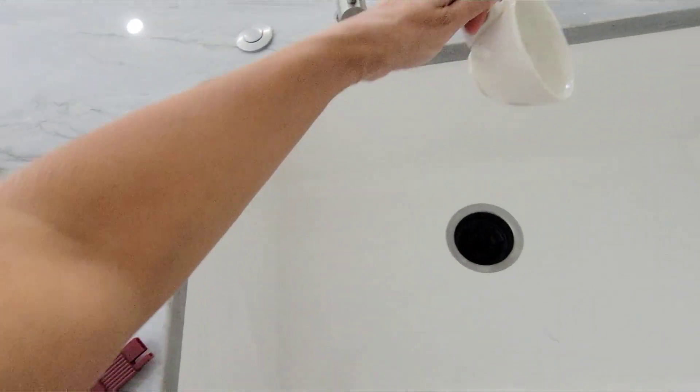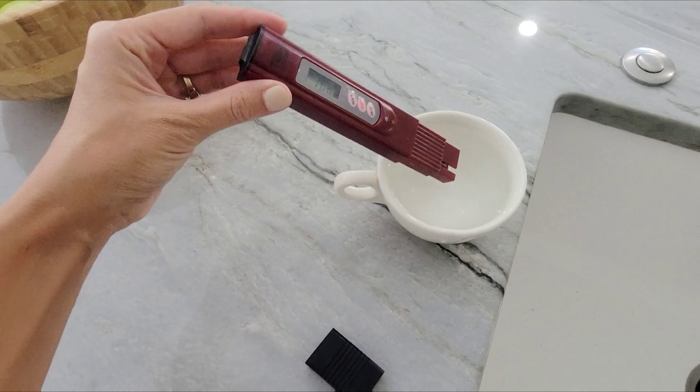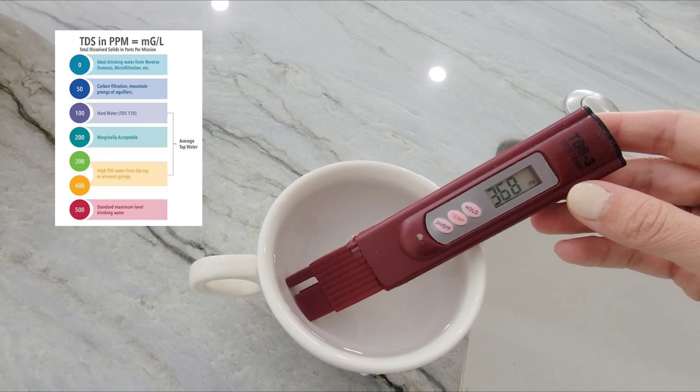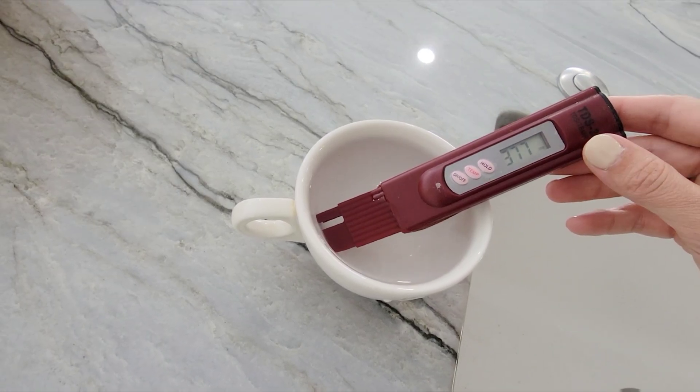That's on. Let's do the sink water first. I'm going to set this inside. It's amazing to think that there's stuff in the water. So around 370 PPM.